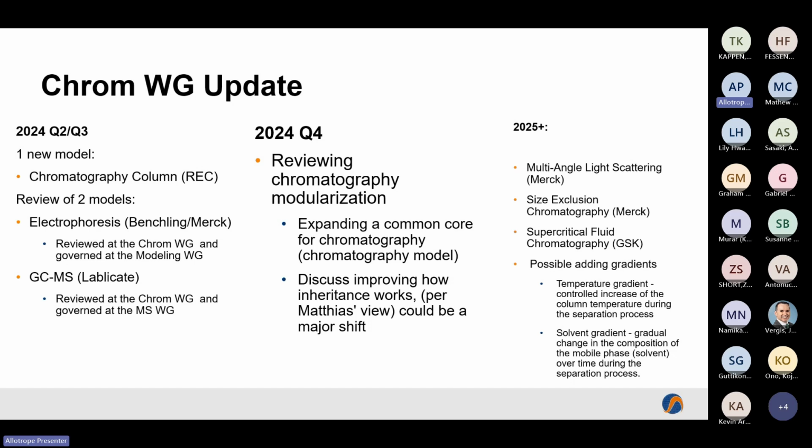in JSON schema, we have a lot of excess content, I'll say, in some of our models, because it basically has to support all the possible detectors, which means you have the option of all of the different detectors when you're trying to do, say, GCFID. You still see things for absorbance, as an example. So we're looking to see if there are any approaches we can take that try and reduce that without being sort of too much of a huge change to the existing structures.